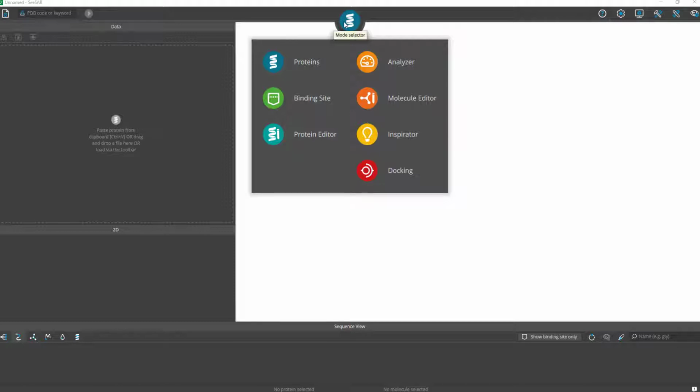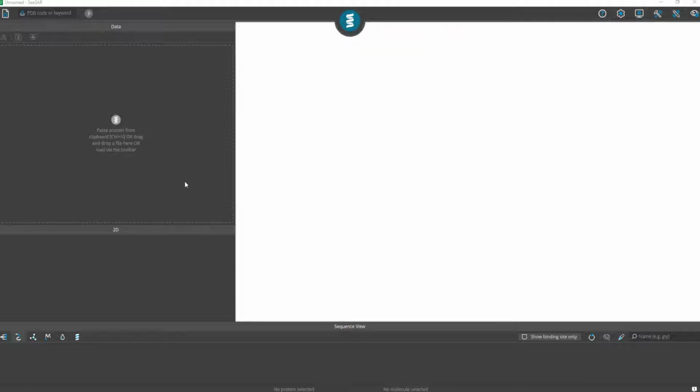Within the scope of this introductory video, we will primarily stay in the protein mode, using it as training wheels to familiarize ourselves with the basic navigation of SeeSAR.